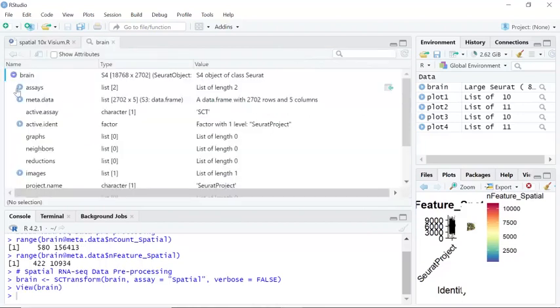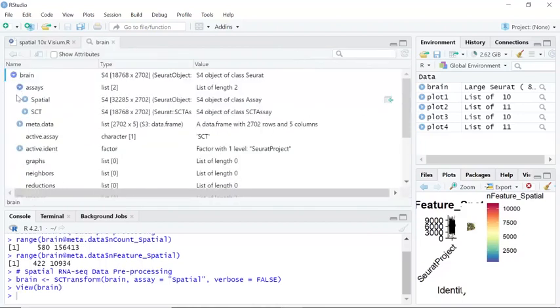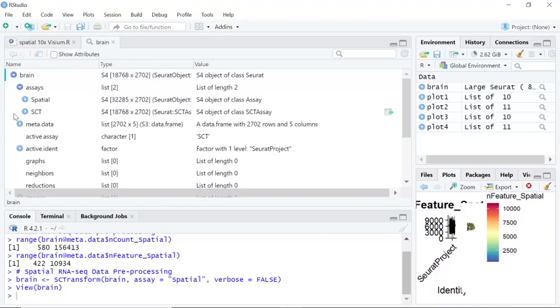You can see the original data was stored in the spatial slot. Following the SCTransform analysis, the analyzed data is stored in the SCT slot. Now we can perform the rest of the analysis.